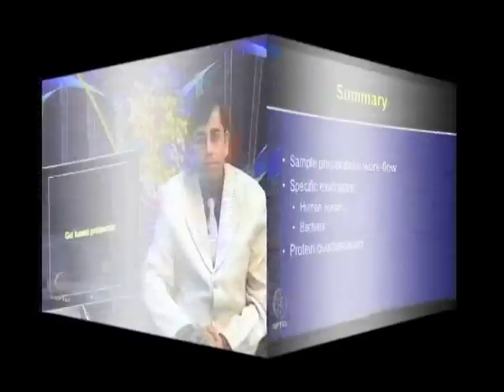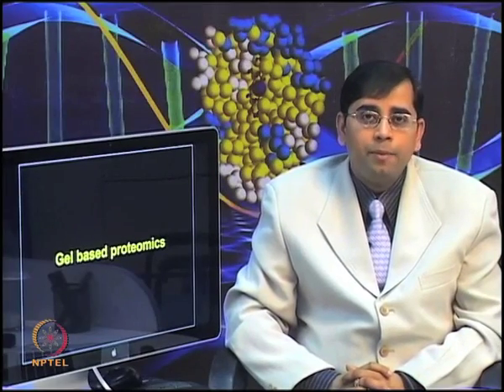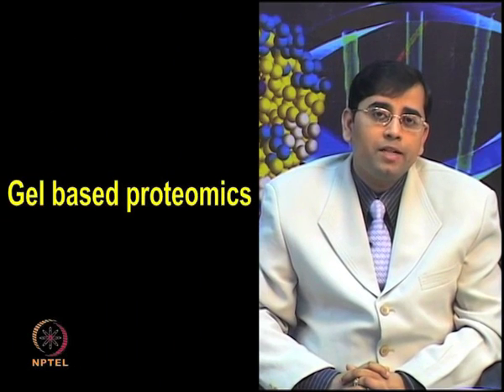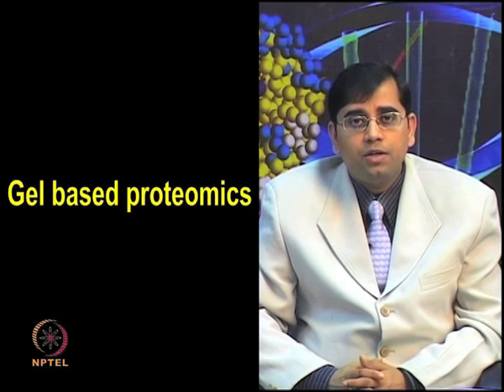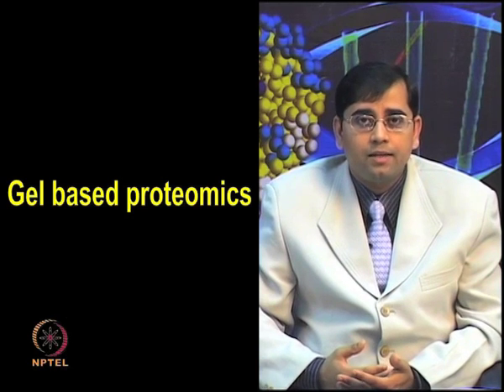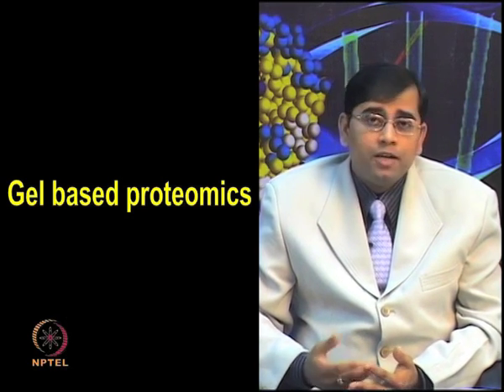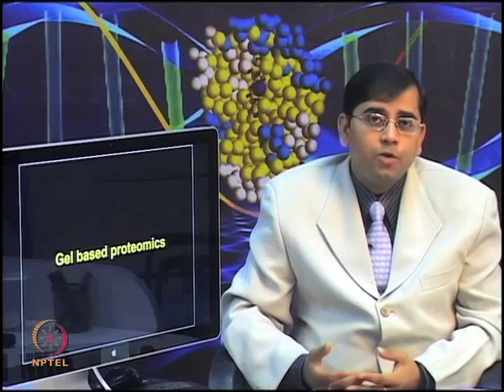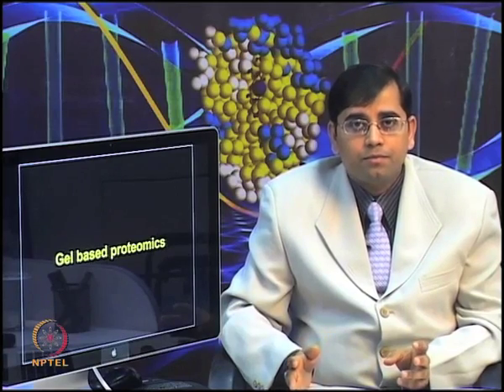We will continue our discussion on proteomics, and now since you have prepared a good sample, it can be applied either for gel based proteomics approaches such as two-dimensional electrophoresis, or it can be used for gel free proteomic approaches such as mass spectrometry. We will continue our lecture on gel based proteomics and then demonstrate how you can use your prepared sample further for analysis of complex proteomes such as serum proteome, bacterial proteome and plant proteome. Thank you.